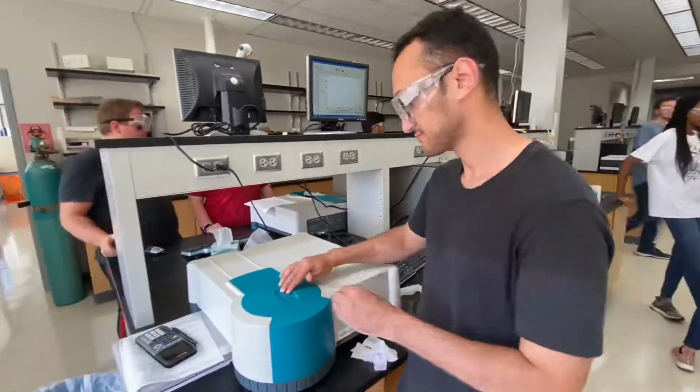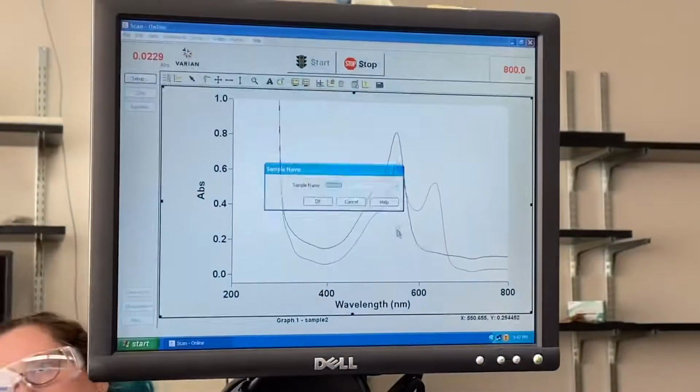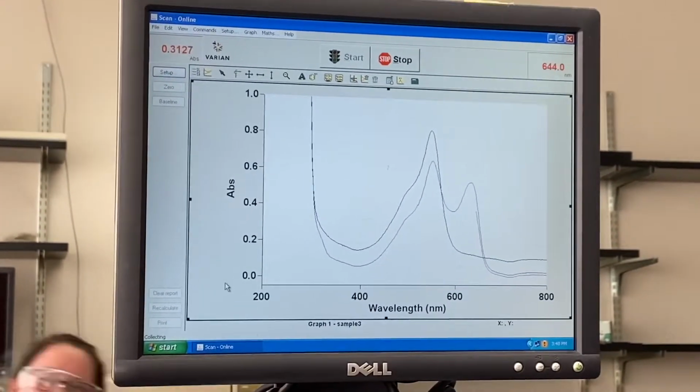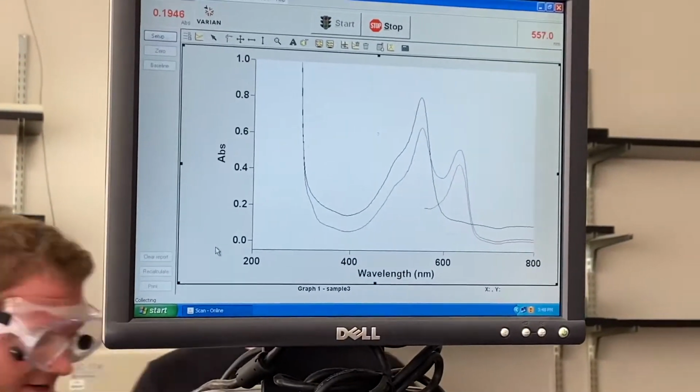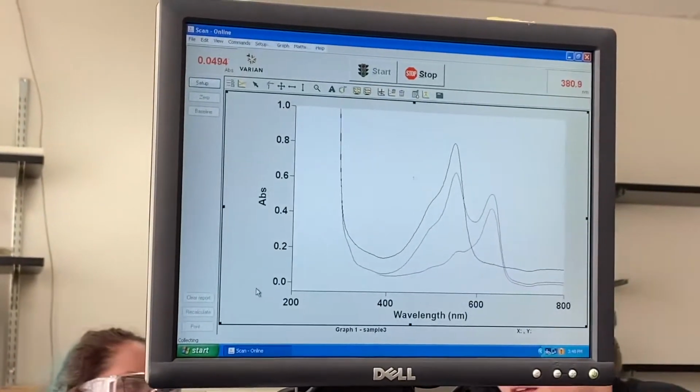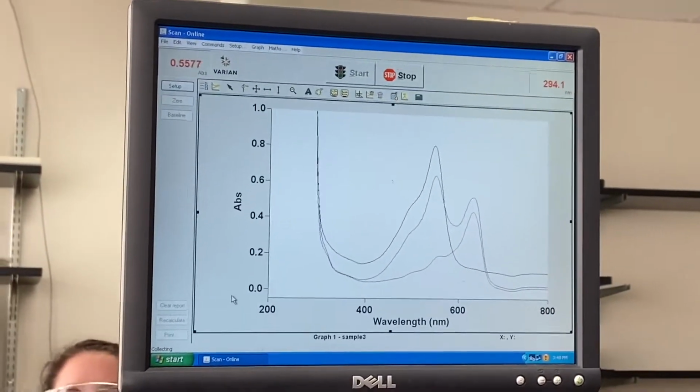In order to determine the absorbance of your sample via the spectrometer, read its absorbance graph to find the lambda max, and its Y value will give you the absorbance of the sample. After following these guidelines, we obtained an absorbance of approximately 0.4 for our third sample.